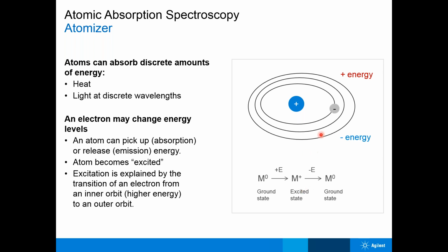So if you can see here, it is gaining the energy, and here it is losing the energy. It means here, if you can see the adding of the energy, it is absorbing the energy, and here it is emitting the energy.